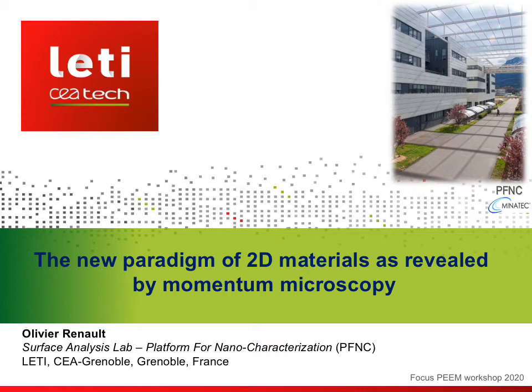And I'm happy to give you now a flavor of what I will hopefully be presenting to you in live mode next year during the FPWS workshop. My talk is about the new paradigm of 2D materials as revealed by momentum microscopy. We are talking here about laboratory-based momentum microscopy.